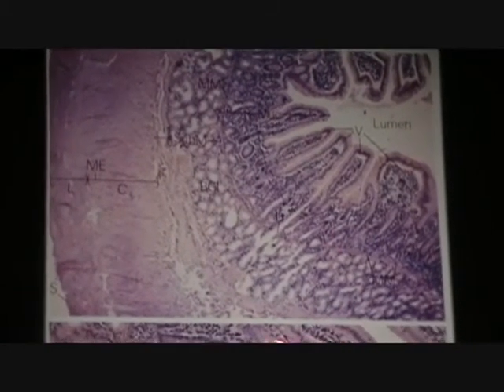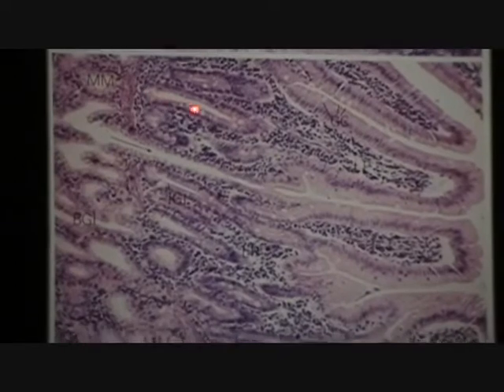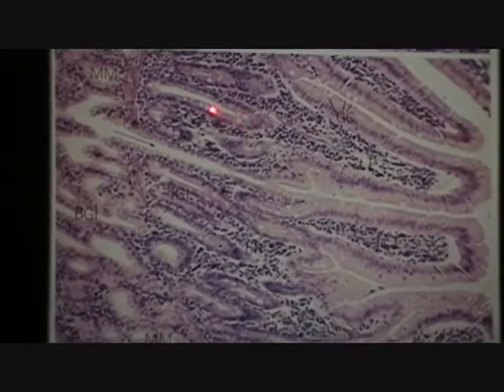You should also be able to identify the little glandular pockets at the base of the villi, crypts or intestinal glands, starting to show these little bubbles. Mucus cells? No way. Gotta be goblets, right? And those little bubbles are goblet cell openings.